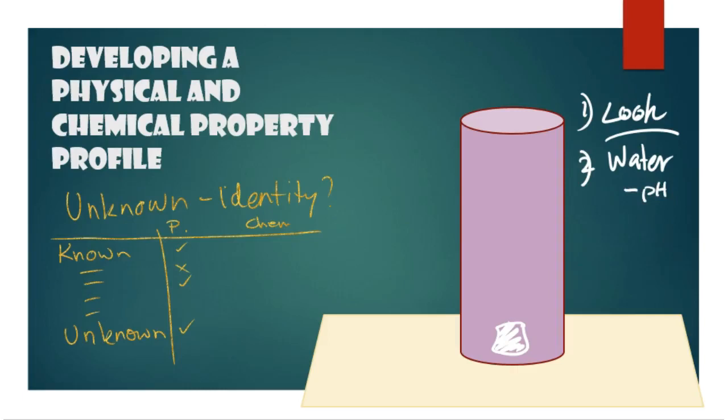So you're going to put some water in there, cover it, give it a little bit of a careful shake, let it dissolve, maybe. And once you've got that little solution there, if you have one, you're then going to check its pH, check a few other things, and do some more ticks and flicks on your sheet to record down its characteristics.